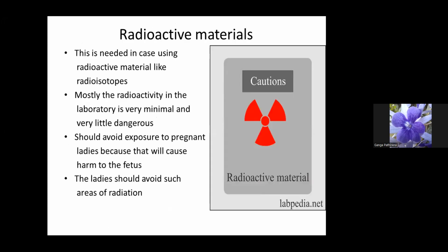Regarding radioactive materials, I think you are familiar with the symbol for radioactive material. This is needed when using radioactive materials like radioisotopes, like in radioimmunoassay laboratories. Most radioactivity in the laboratory is very minimal and of very little danger. Exposure should be avoided by pregnant ladies because that will cause harm to the fetus, and ladies who are expecting should avoid such areas of radiation as well.